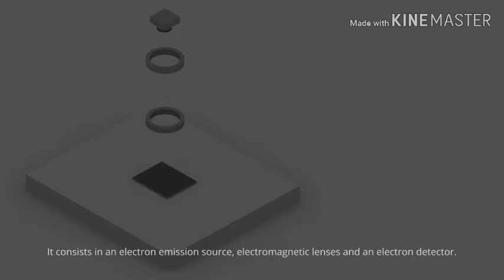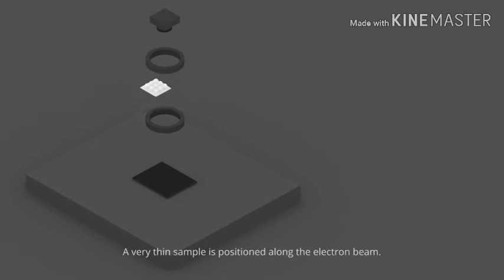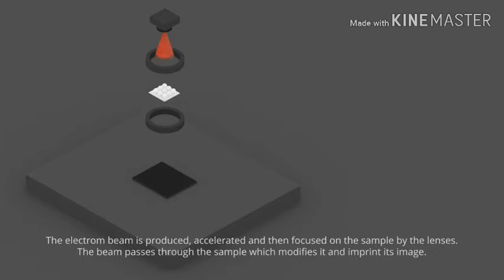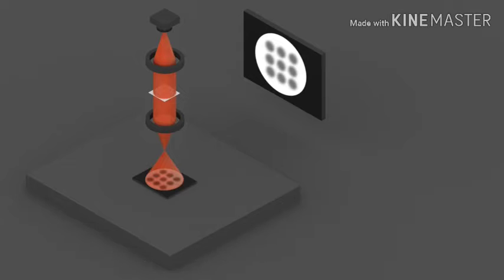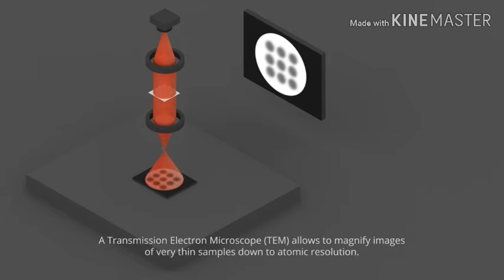It consists of an electron emission source, electromagnetic lenses, and an electron detector. A very thin sample is positioned along the electron beam. The electron beam is produced, accelerated, and then focused on the sample by the lenses. The beam passes through the sample, which modifies it and imprints its image. The beam is then magnified by other lenses and detected, for example, using fluorescence. The transmission electron microscope allows magnifying images of very thin samples down to atomic resolution.